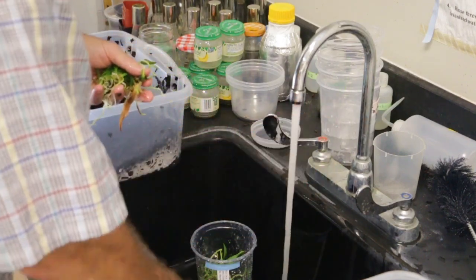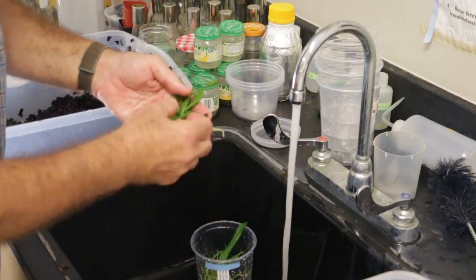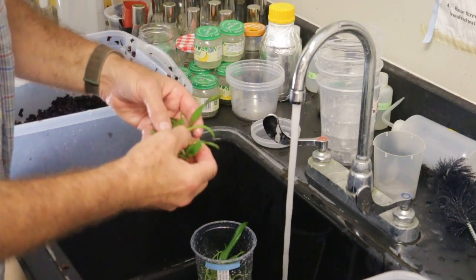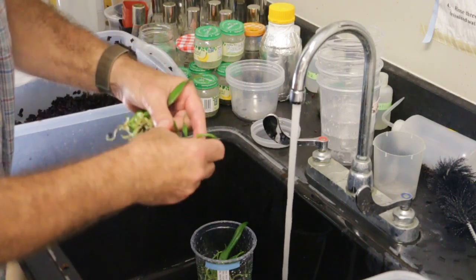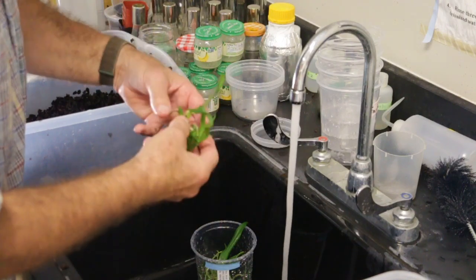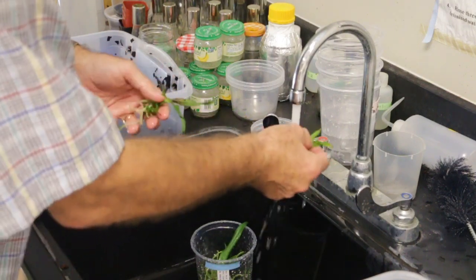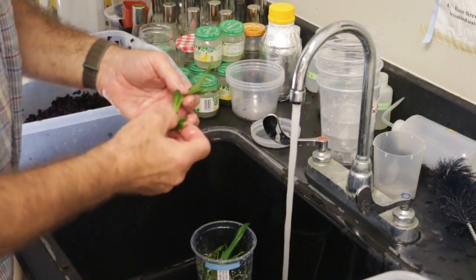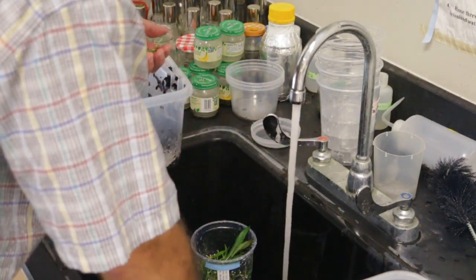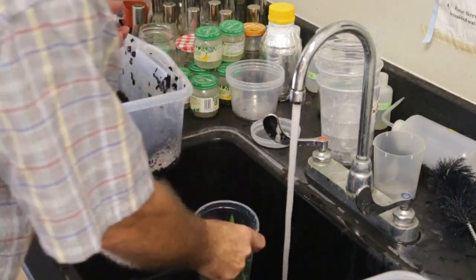Sometimes, you know, things do get a little stuck together. Big plant, bad leaf, but there's so many. I'll show you the plants that are left over at the end that I'm just not going to flask, because this is a hybrid that I have a few of, and I'm not sure I want to mess with all of these plants. It's late in the day, and I've already done so many. Okay. So, these are the ones I'm going to keep, and I think there's probably around 20 of them here.